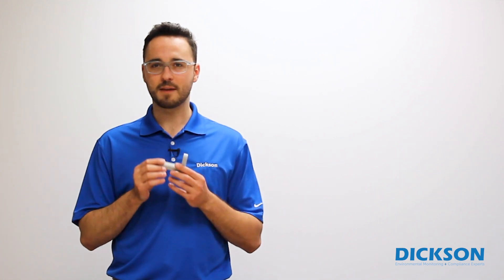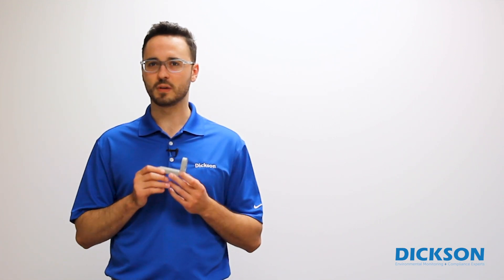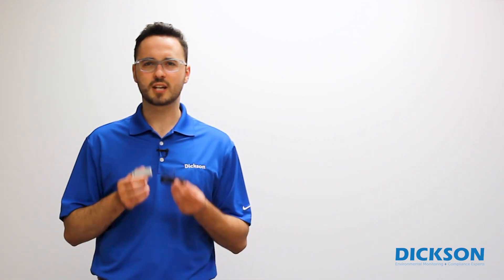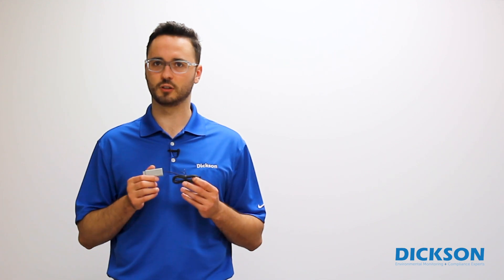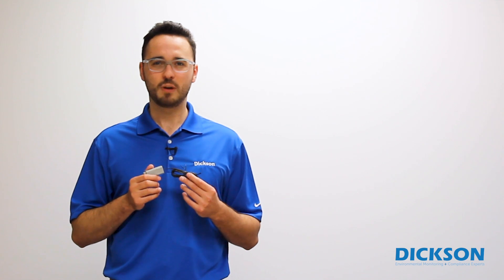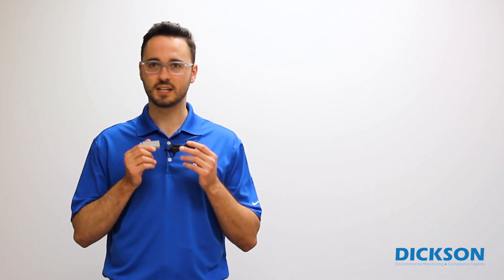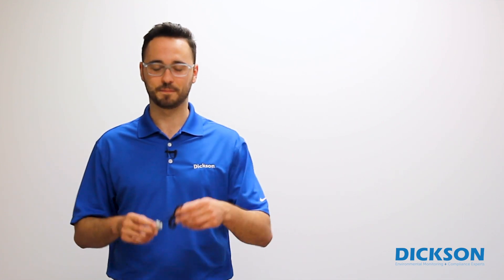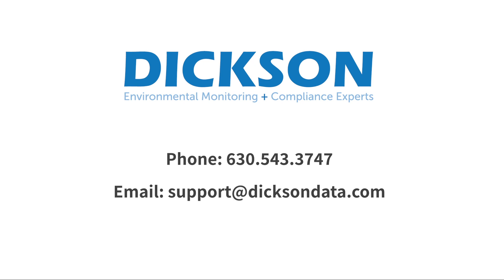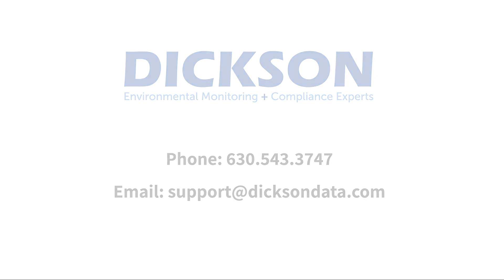This sensor records ambient readings like temperature and/or humidity, but we also have other replaceable sensors. For example, this one is commonly used in conjunction with a buffer solution like glycol to monitor temperature in refrigerator or freezer applications. We have a replaceable sensor to meet the needs of almost any application. If you have any questions, please give us a call at 630-543-3747 or email us at support@dicksondata.com.